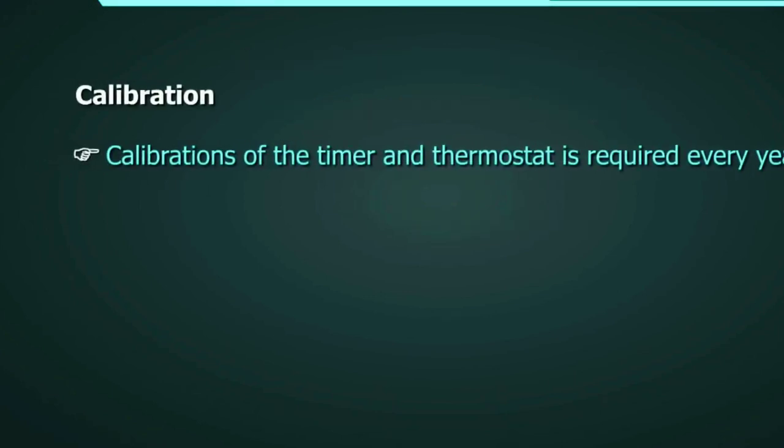Calibration. Calibrations of the timer and the thermostat are required every year or as per lab policies.